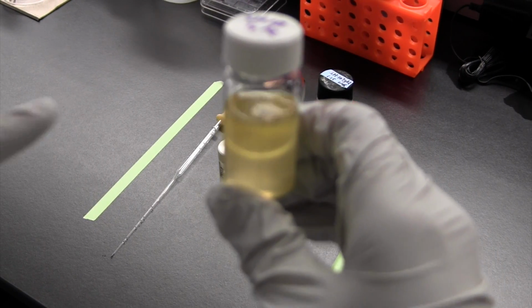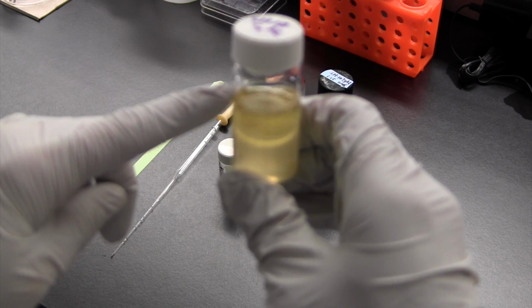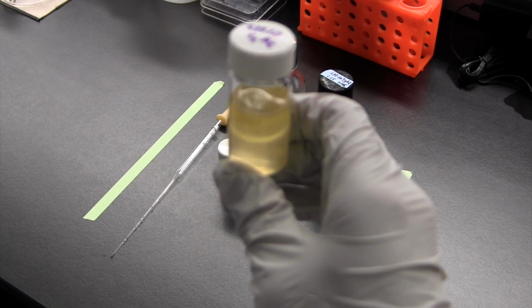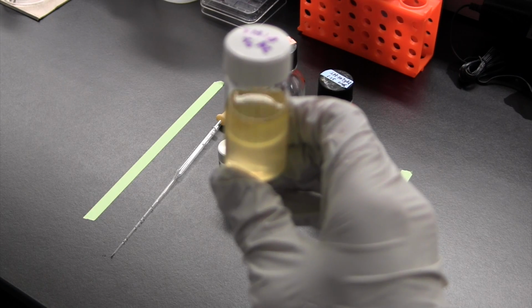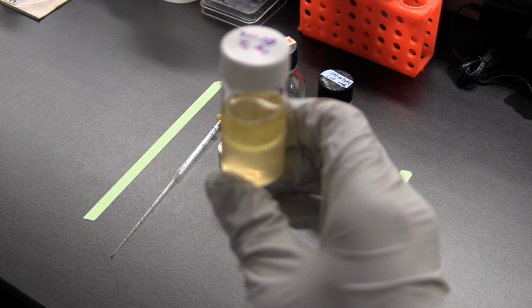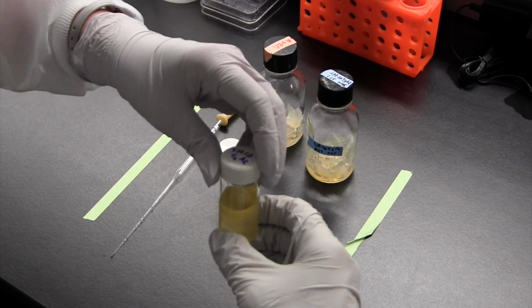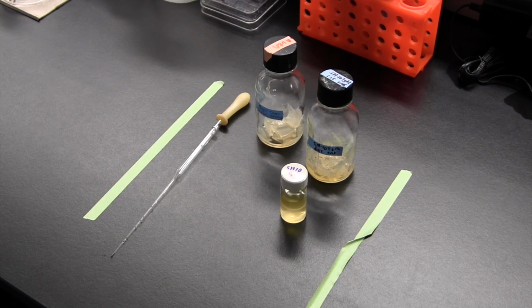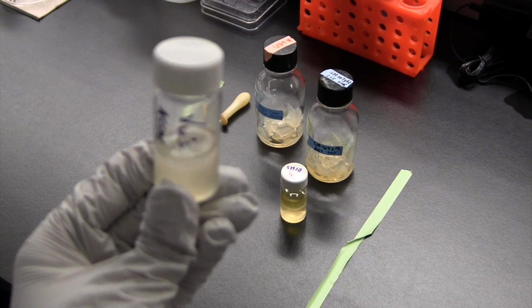And so the next step in this process is essentially drawing that boundary that top layer off, because that is the only layer we're going to work with when we're going on to the next step. In this extraction, you can see that the layers did not separate nearly as clearly.